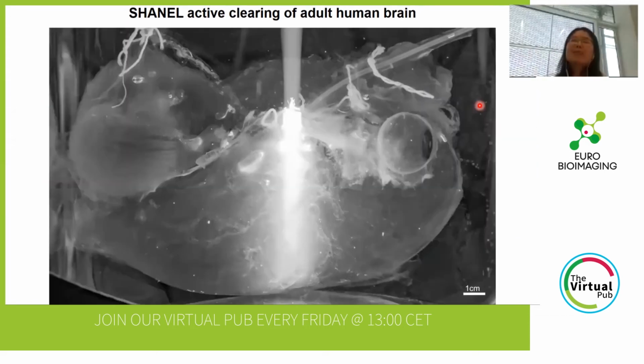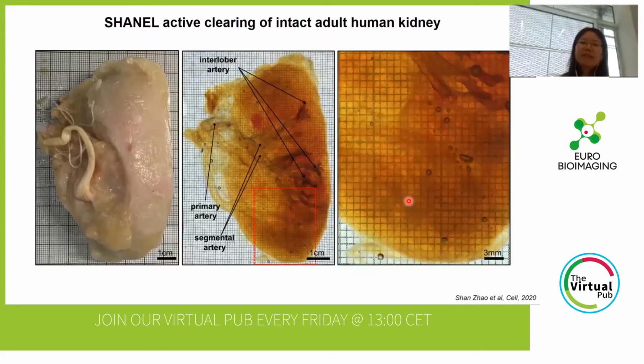So in about 4 months of the whole process, including the pretreatment and also dye labeling and also clearing, we made, for the first time, the human brain become transparent. And we can see that condensed light could travel end to end through the whole human brain to show the transparency. So of course, not only the human brain, also other human organs.